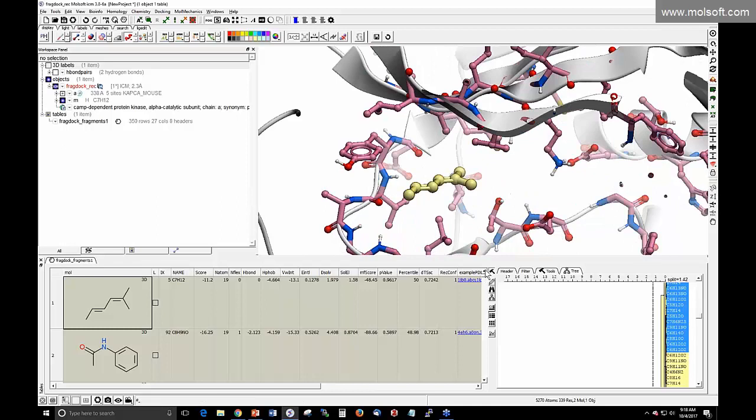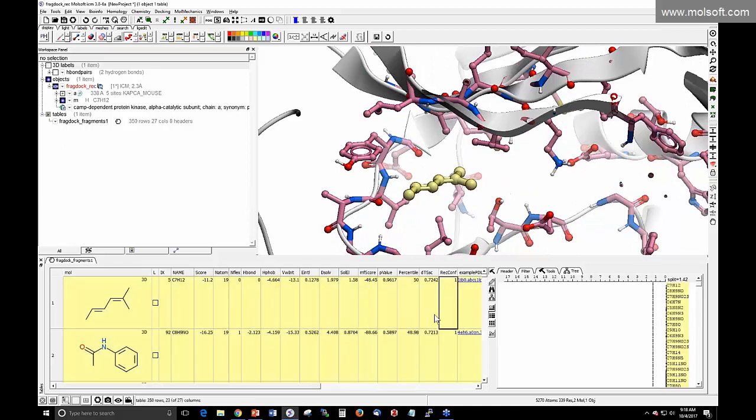So we have the hit list. We had a question about how the p-value was developed. We have the fragment database from the PDB, and each fragment is pre-scored for each member of the library, and this allows an estimation of the true positive and true negative rate for any score cutoff.